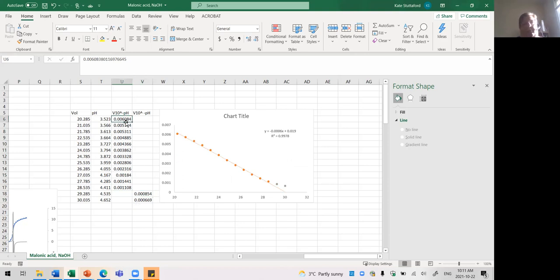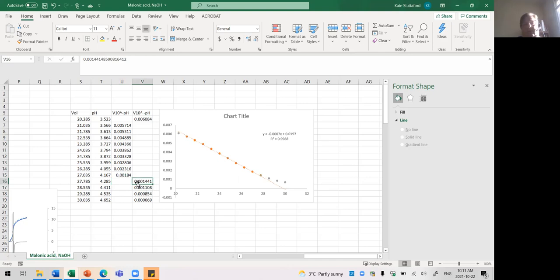I think this top point also should be taken out. Oh, that's looking better. Though the R squared did not improve dramatically. Okay, so there's 988. Let's try one more at the bottom end. No, that didn't make any difference in our R squared value. What if we take out one at the top end? I think that might be our best bet.